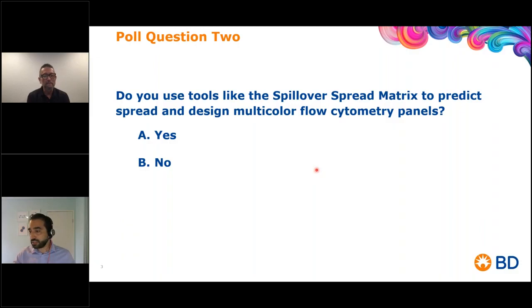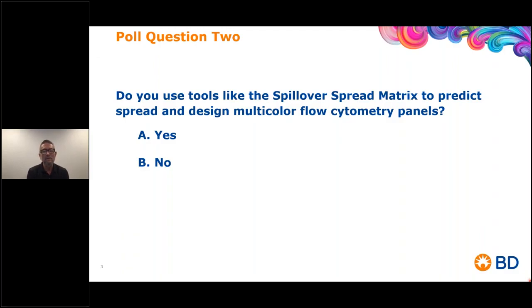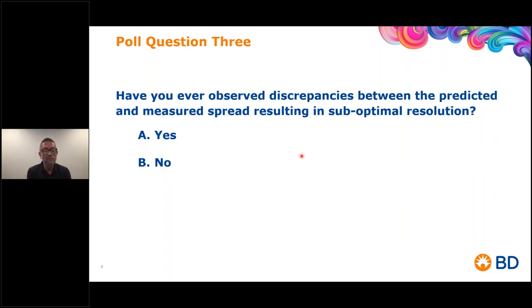Well, actually, I'm having some hard time seeing the results. So Mirko, maybe you could come off your video. Oh, yes. One second. There you go. Now ask that question, Mirko. Sorry, Bob. I have a very hard time seeing the results on my screen. So if you could just give me. Yeah, it was 64% actually used the spillover spread matrix. Great. Okay. So let's go on to the third question.